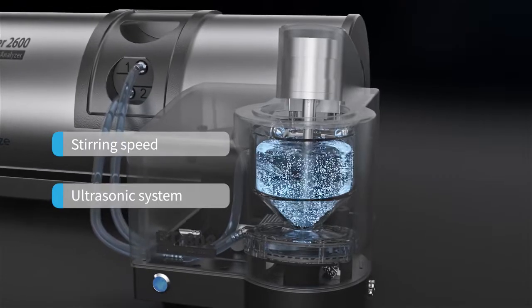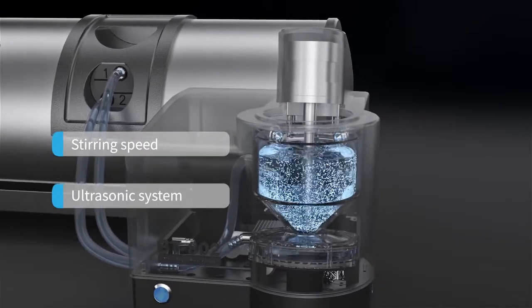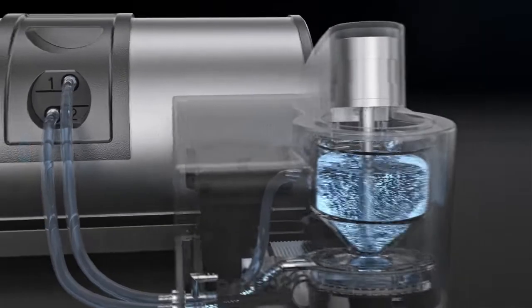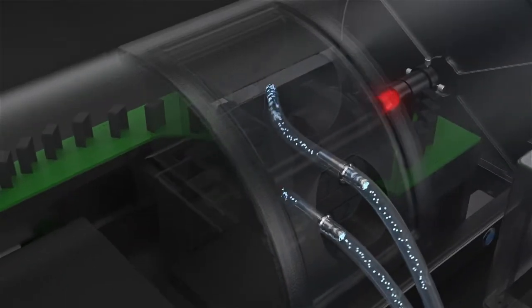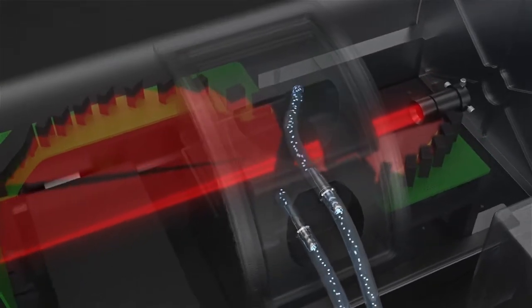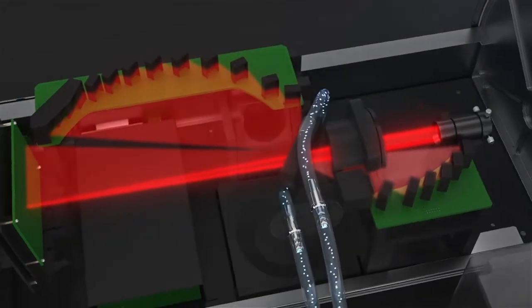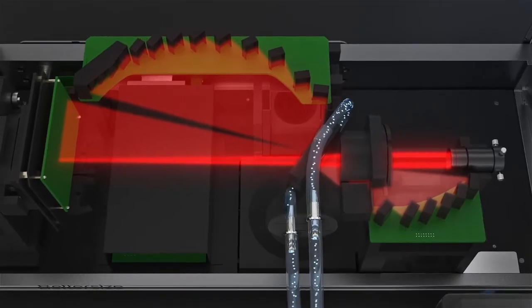The BetterSizer 2600 is superior in the combination of Fourier and inverse Fourier design. This smart design allows accurate measurement over the whole range, from nano to millimeter scale. The tilted sample cell design significantly diminishes the effect of total internal reflection.